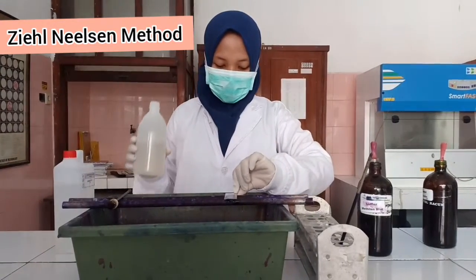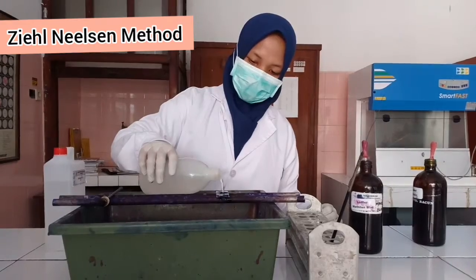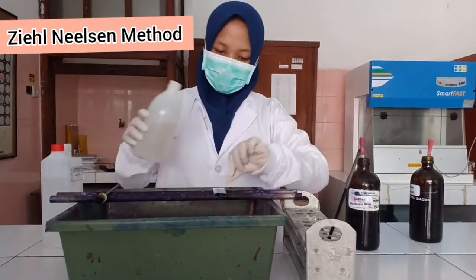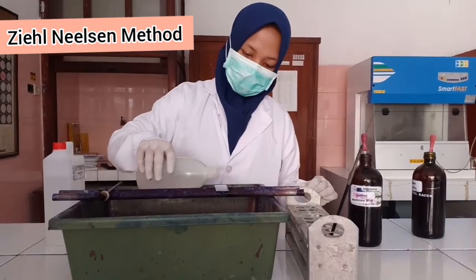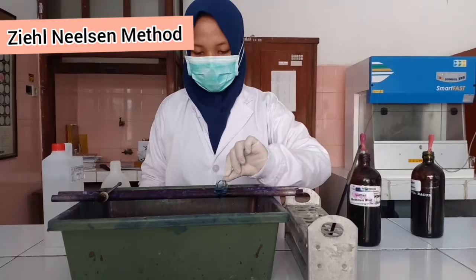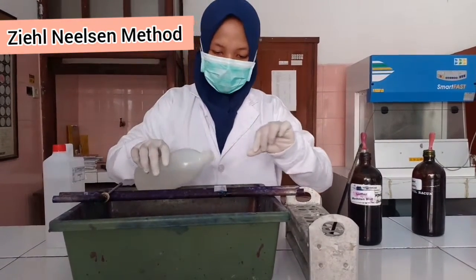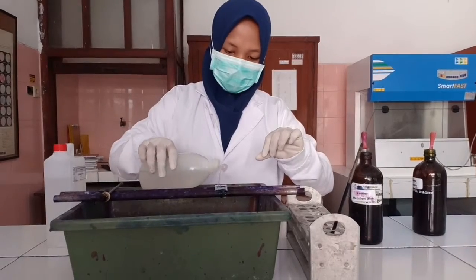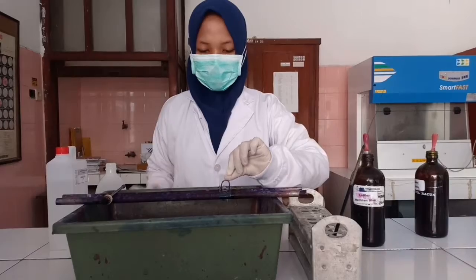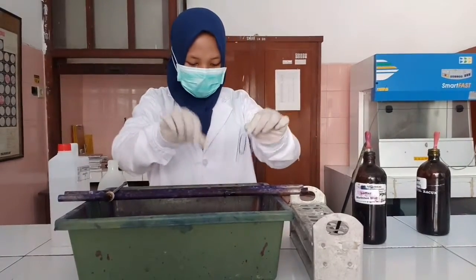After that, rinse again with water for 30 seconds. Finally, dry in the air.